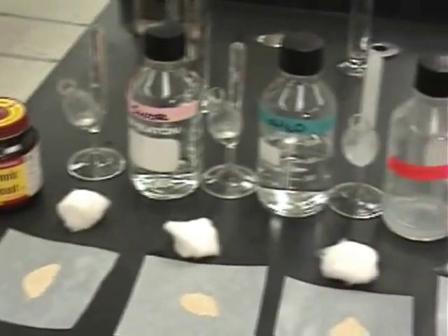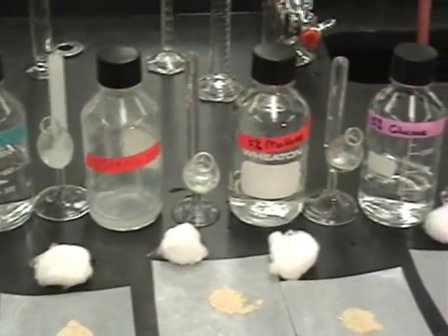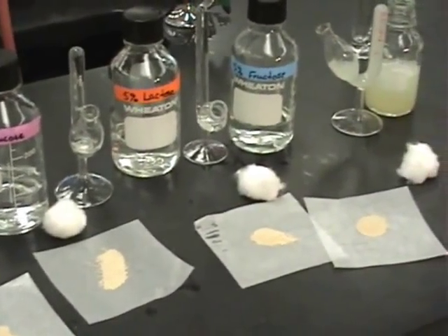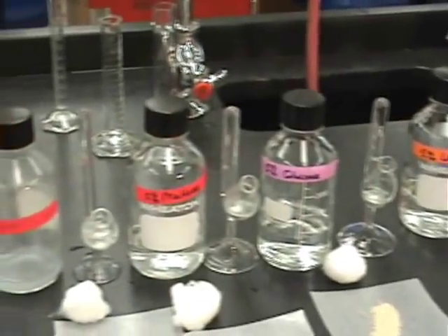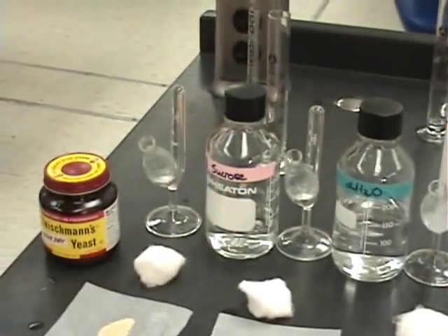The Smith fermentation tubes are calibrated so you can see the volumes. We have different solutions set up and ready to go from your lab packet: protein, fructose, lactose, glucose, maltose, starch, distilled water, and sucrose.